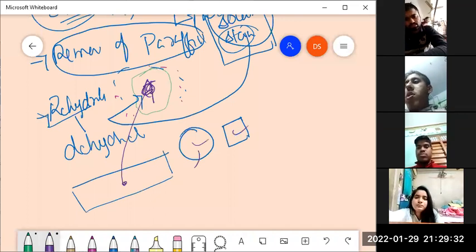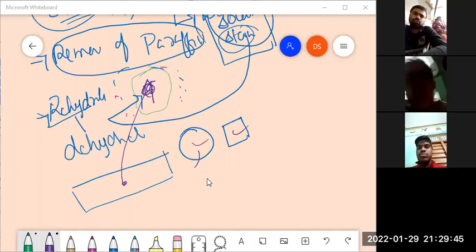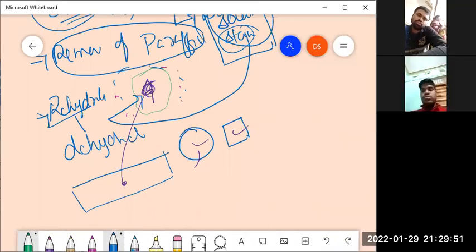So if it ever happens that the objective is coming in direct contact with the tissue, then that direct contact can damage both the tissue as well as the objective lens. So in order to prevent the damage, it is always better to cover up the tissue with a cover slip. Understood? Why is it necessary? Yes, sir.